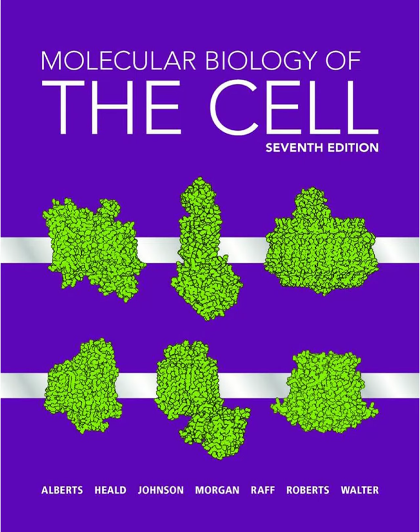But first, you have to preserve the tissue structure. Fixation, right, using chemicals. Yes, typically chemical fixation with something like glutaraldehyde. It cross-links proteins, essentially locking everything in place. Then what? The tissue is still soft. Right, so after fixation, you dehydrate it and embed it in a supporting medium, like paraffin wax or plastic resin that hardens. Now you have a solid block. Ready for slicing. Ready for the microtome.